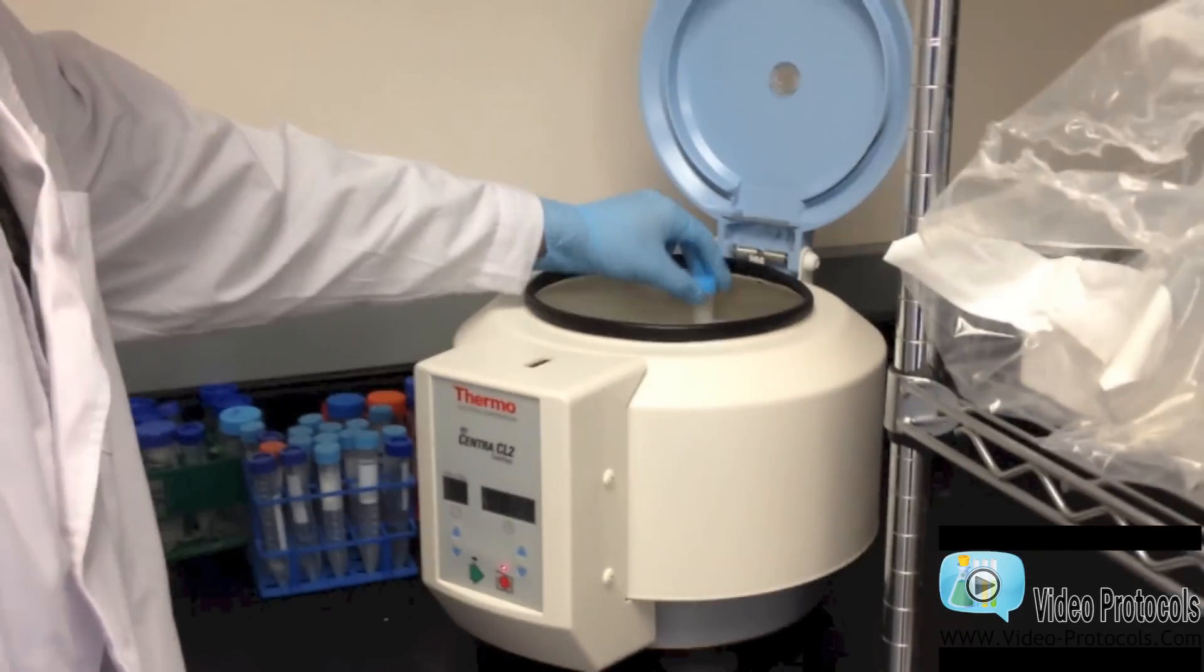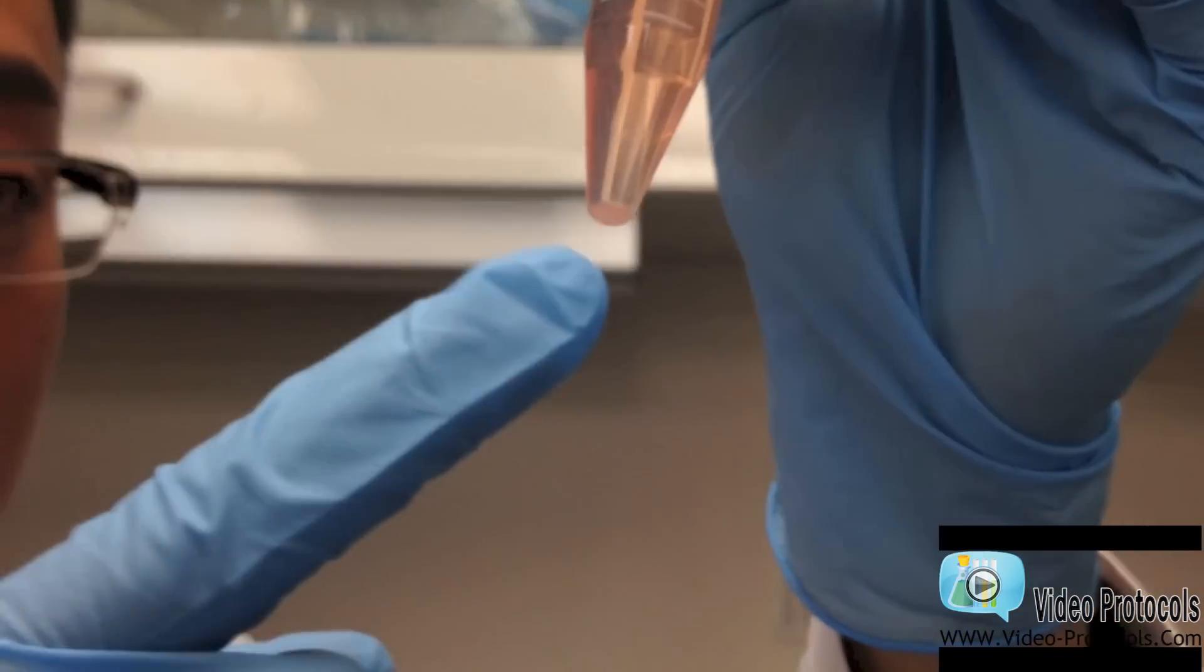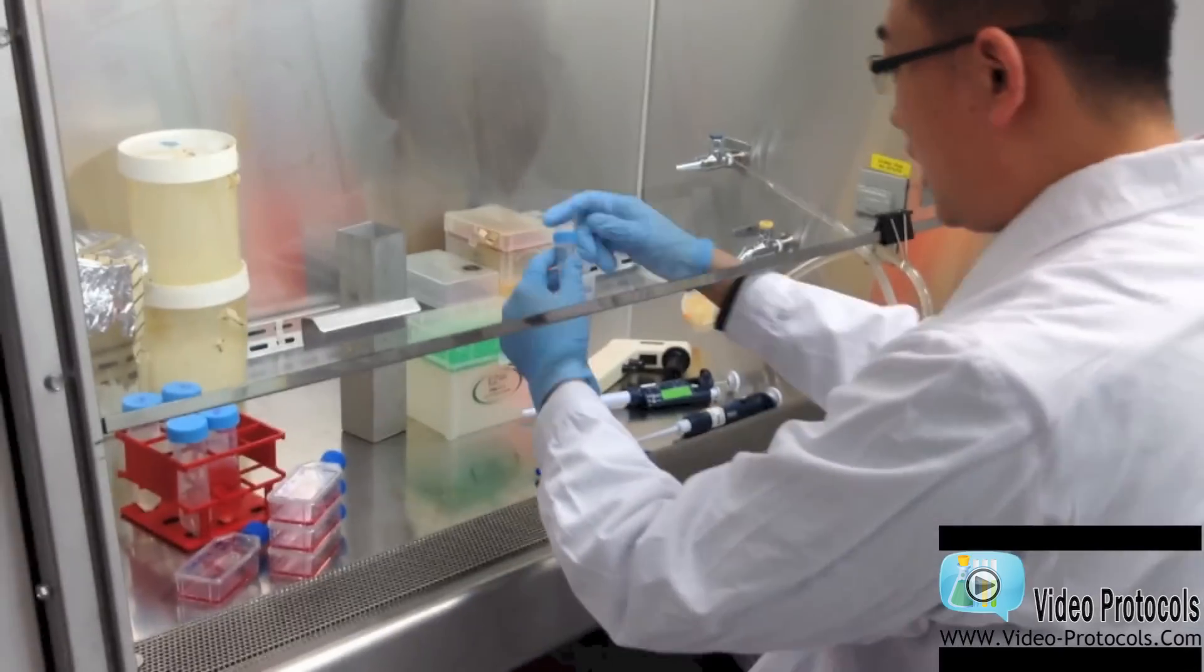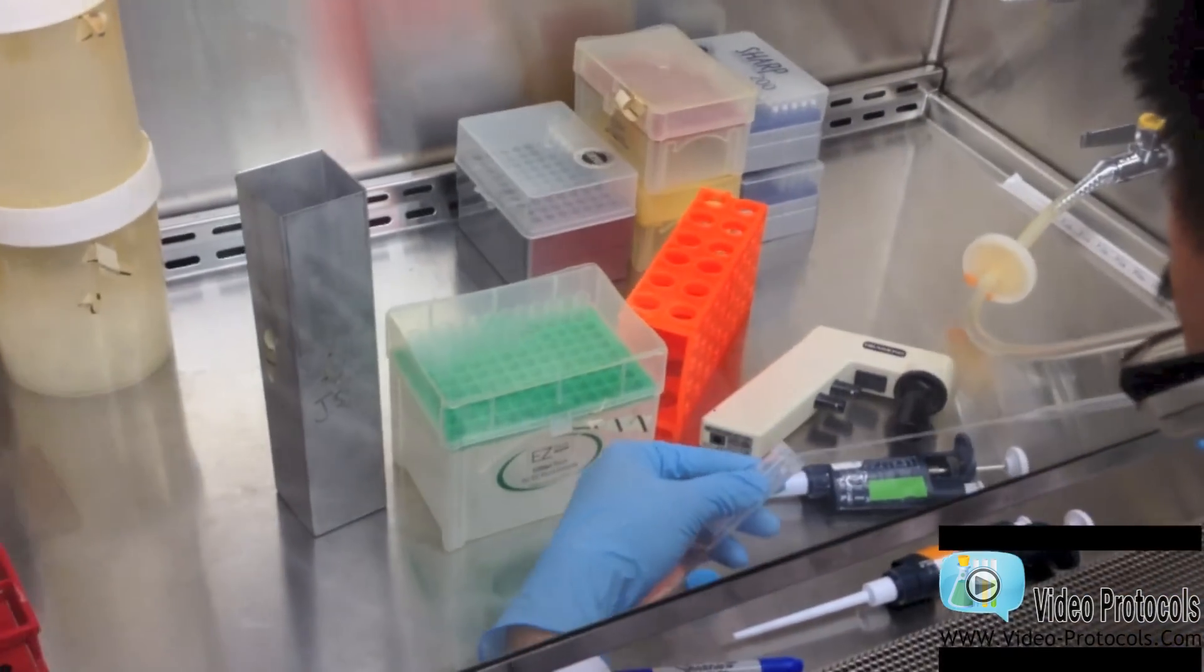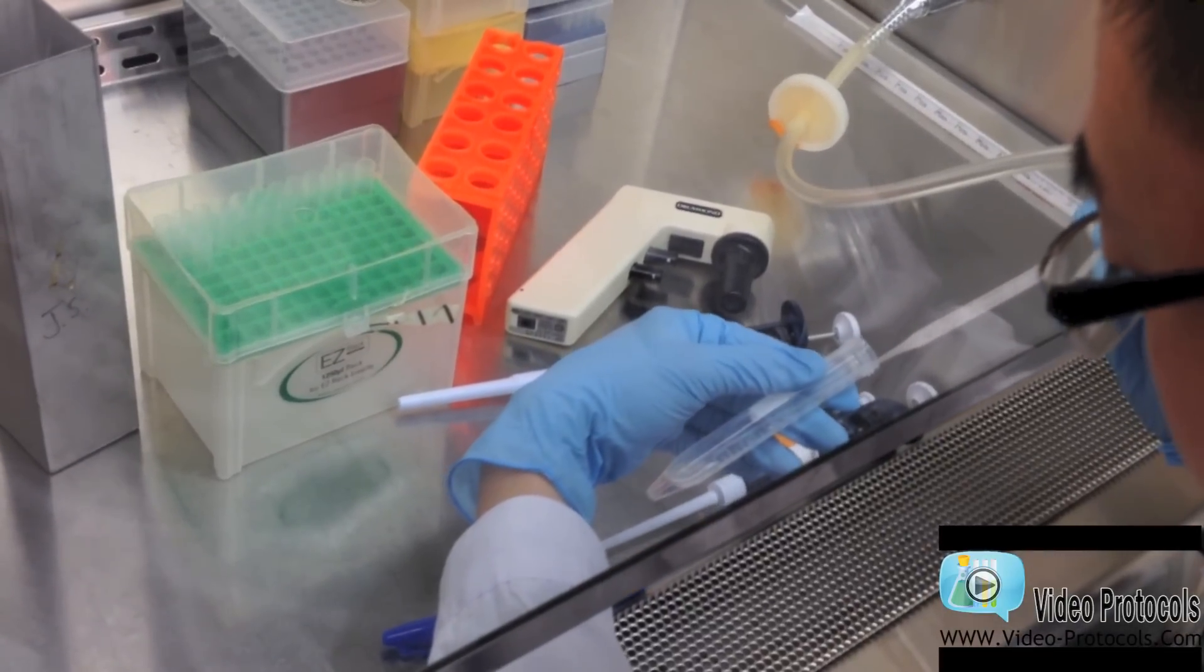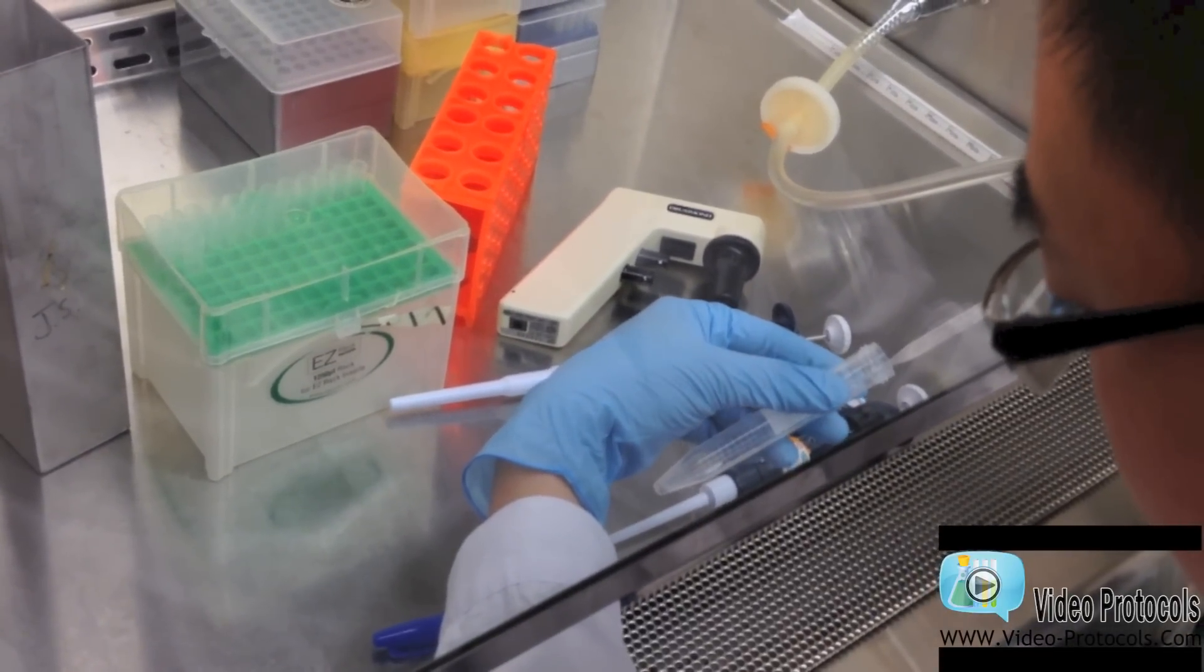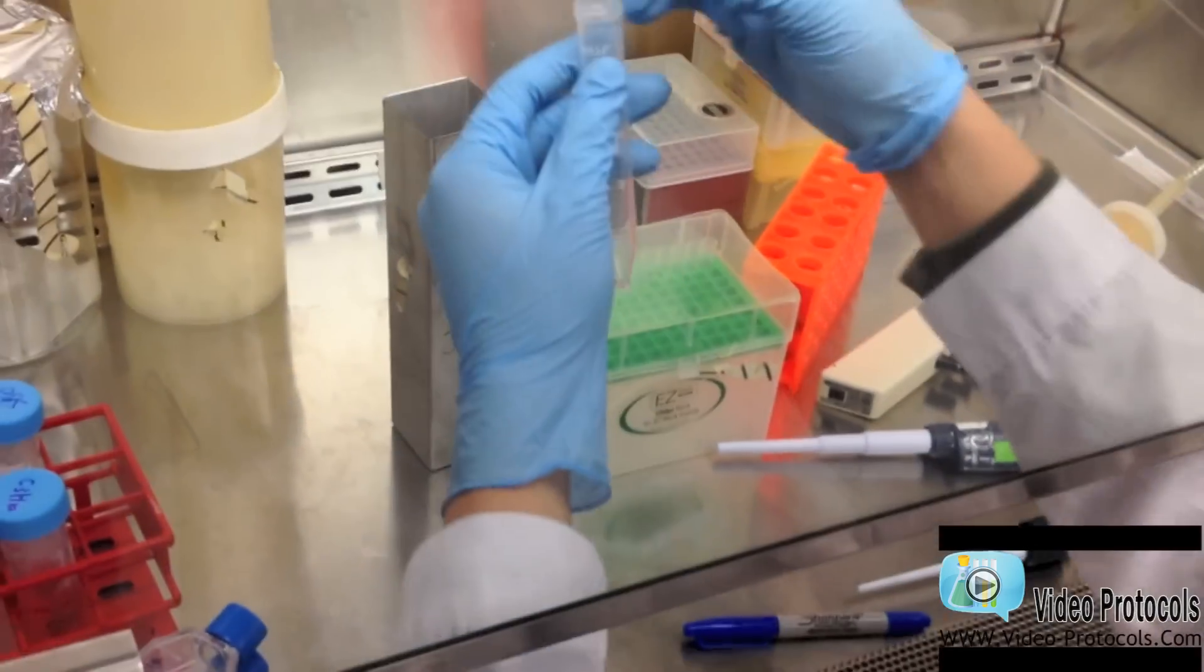After the centrifuge is done, you take out the cells and you should be able to see there is a pellet down. That's all the cells basically. I am going to aspirate the media and the trypsin. Because again, trypsin is not good for cells. And you need to make sure that the pellet is not sucked out.